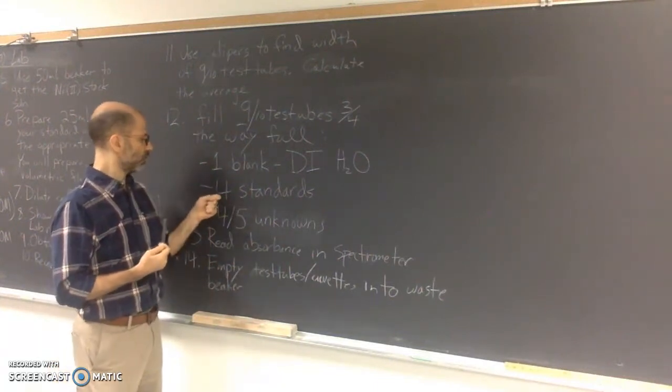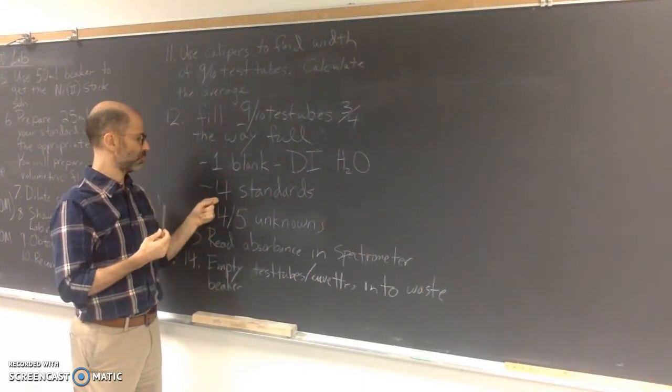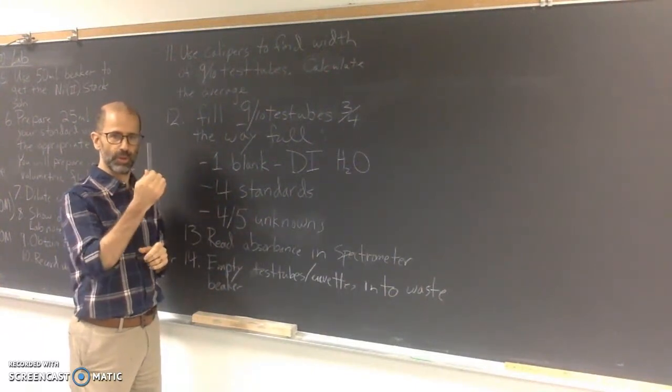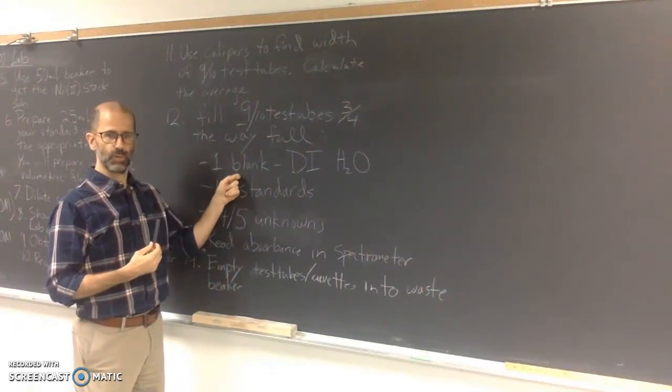You're going to have 4 more of these. Each of these is going to be filled 3/4 of the way full with each of your standards. So you're going to have 4 test tubes for your standards, and 1 for your blank.